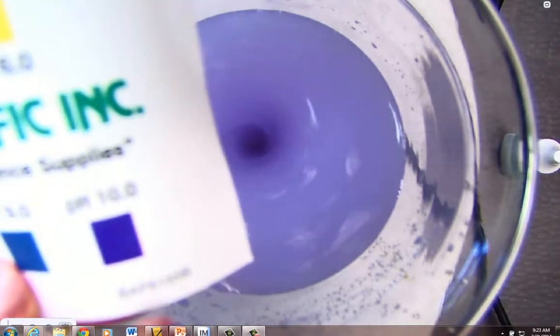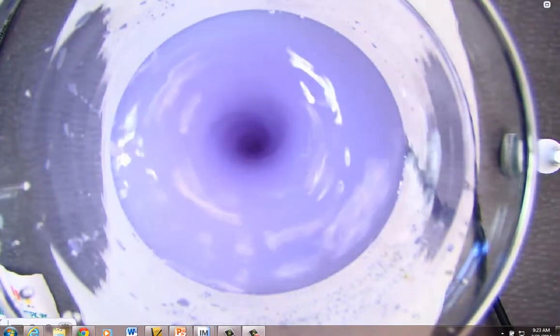Notice that we now have definite evidence of a base. The pH wheel here is coming in at about a pH of 10 to match this color. Now what we have is a dynamic equilibrium with the ions and their solid, and I'll write that on the whiteboard and we'll take a look at that.